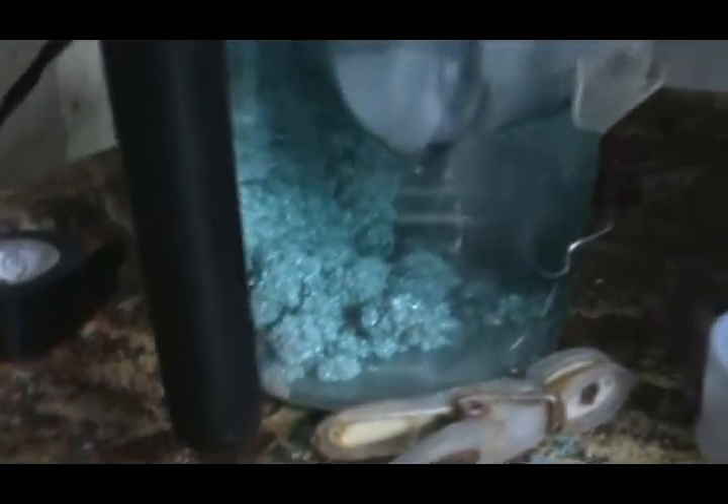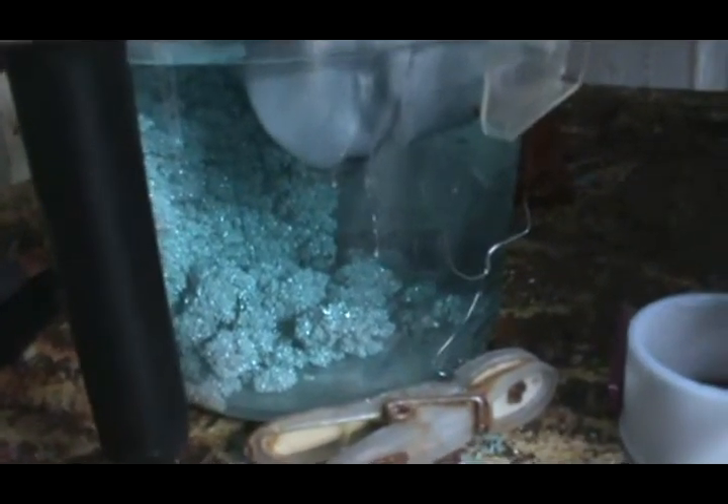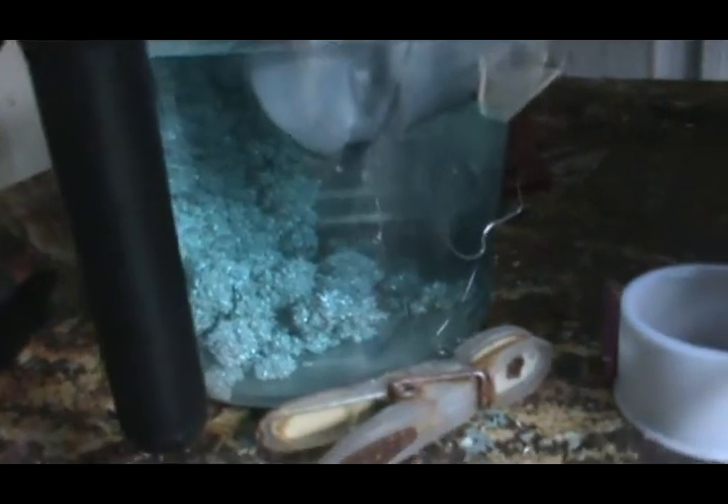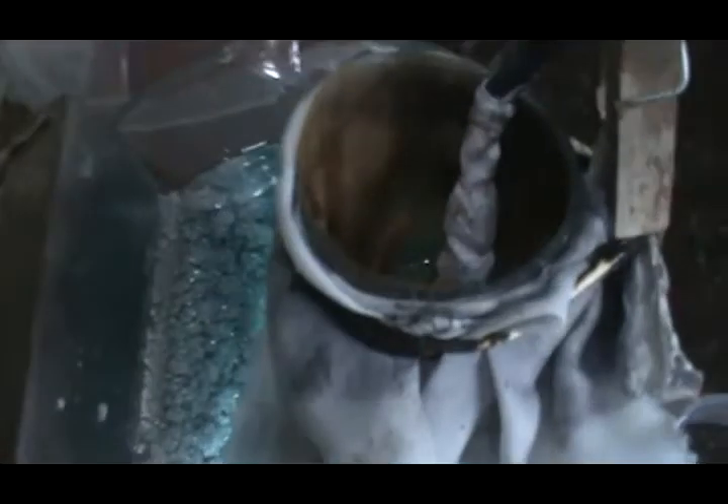Over the next few days I'm going to do a video on how to refine silver electronically through electrolysis — how to refine silver to 999 purity. There are the crystals I've started to grow. They're growing on a stainless steel sheet with a negative hooked up to the stainless steel sheet and a positive hooked up to a silver bar that is almost pure but not quite.